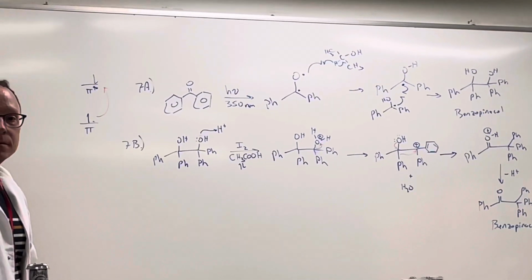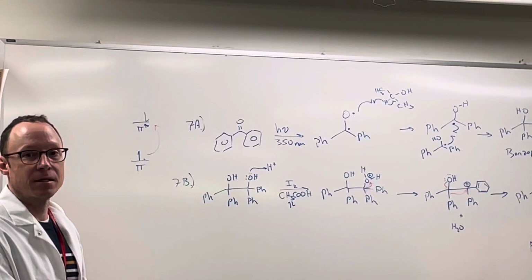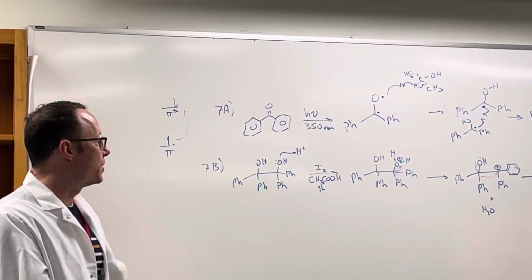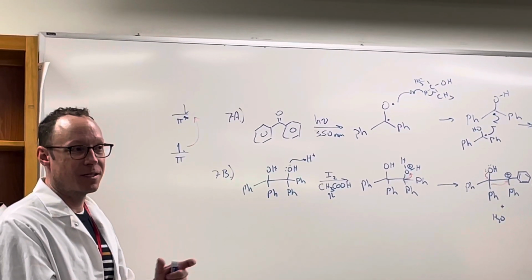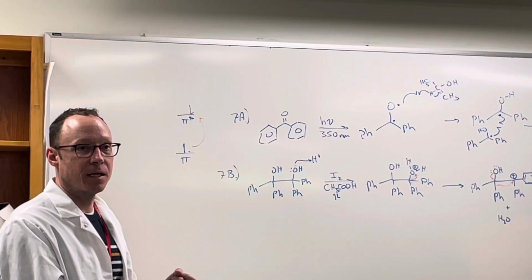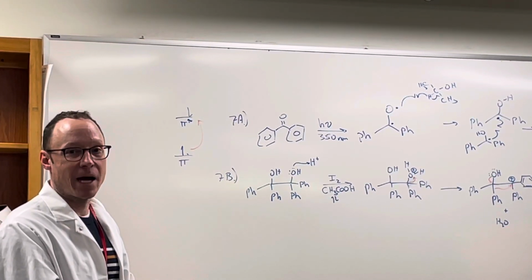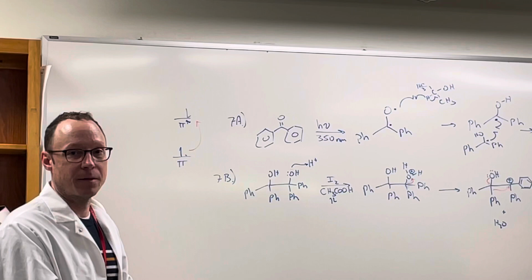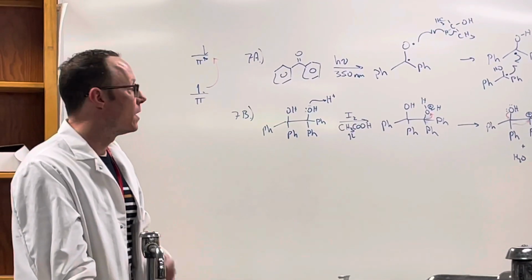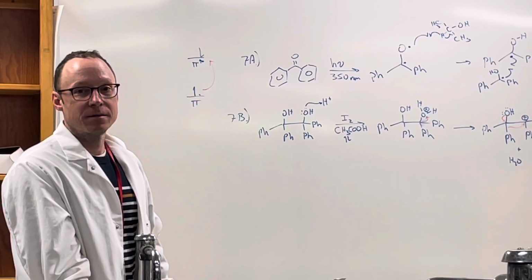How do you know that you've got enough iodine in there? As long as your solution is colored, you'll have enough. Depending on how much you use, it's going to change the color. Your solution could be anything from a pale yellowish brown to a deep burgundy, almost black. But try to use as small an amount as possible. There's almost no such thing as using too little.